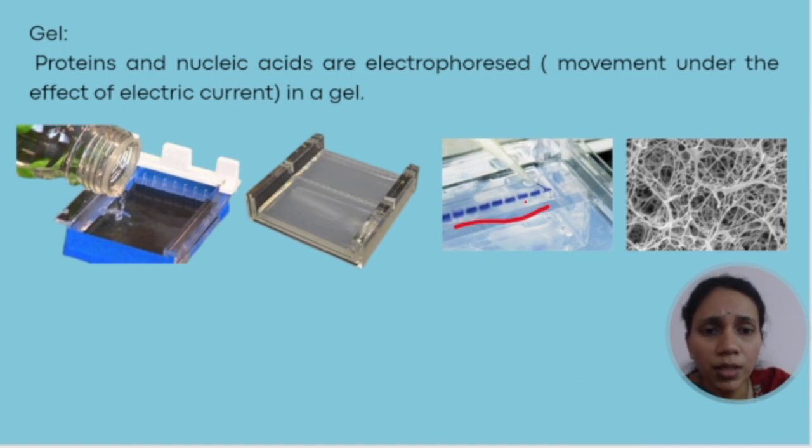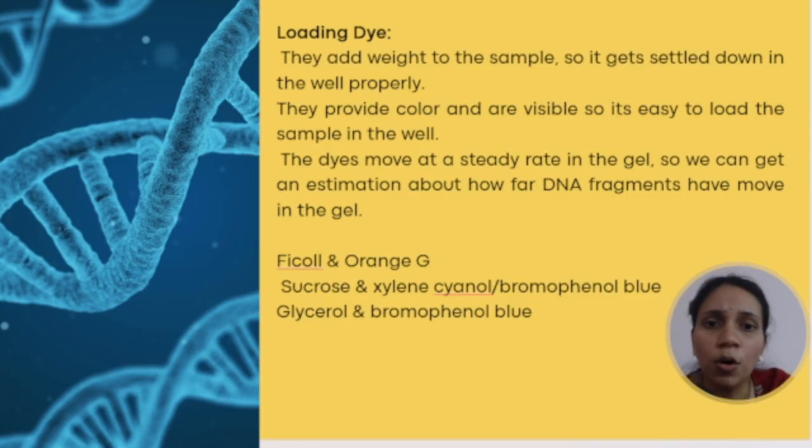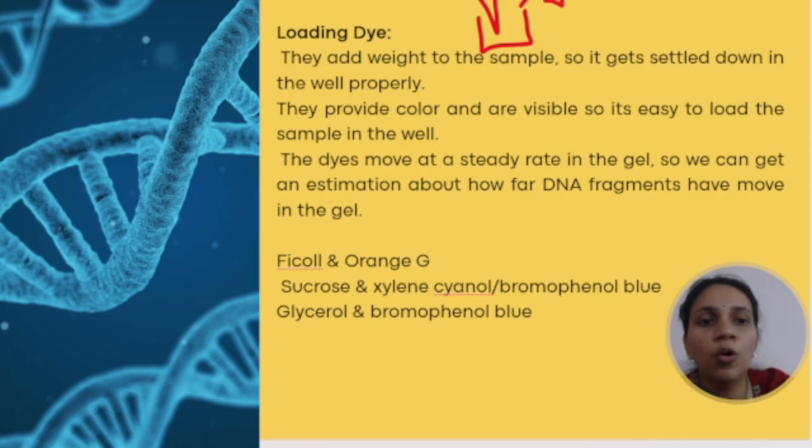So the use of this tracking dye becomes very easy, very essential. We also call it a loading dye or tracking dye. So what is the work of this loading dye or tracking dye? If you see, the wells are like this, right? And the buffer is flowing through this. So when we load the sample here, the DNA should be able to stay inside the well rather than moving out of it. So that is of no point. So the main function of this loading dye is to make it settle down.